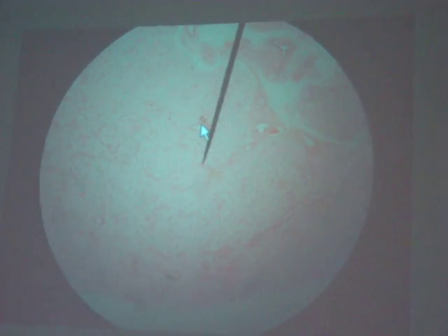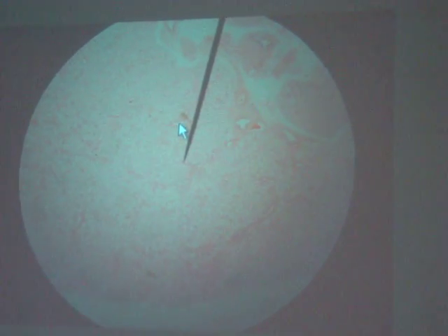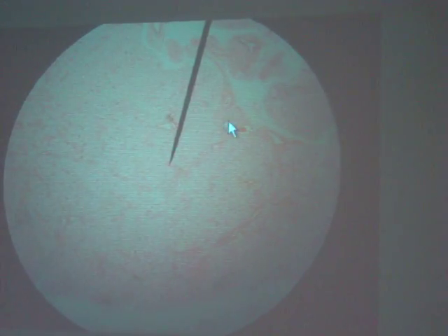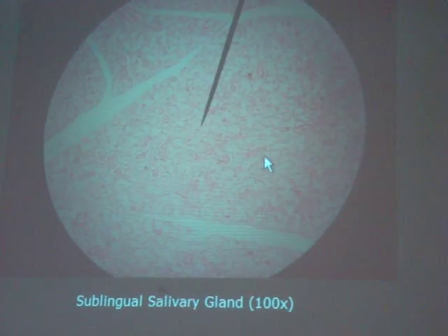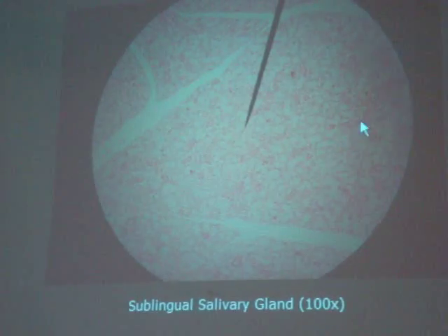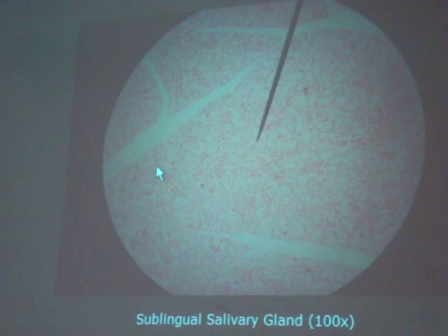Sublingual gland. You got that. The duct is right there, so you can see the light space or the empty space in the middle. Again, you're taking a cross section of a tube, so it's going to be empty in the middle. That's probably another duct right there. There's another one. Okay. And what's the other one? Mucus cells. There's one there, there, all these little ones. Yeah, the dark ones. Here's a line of them right here on the right side. Here's some more in the middle.